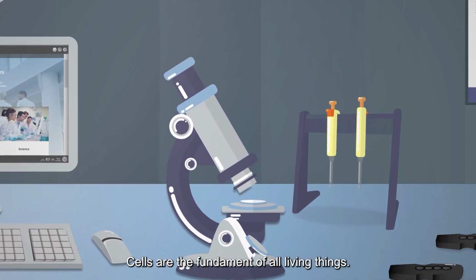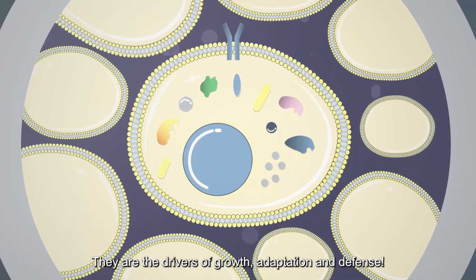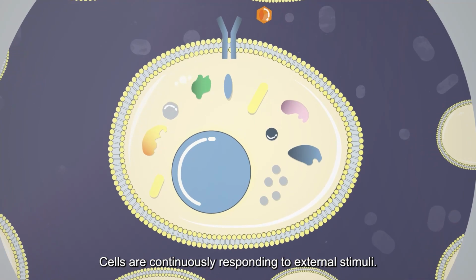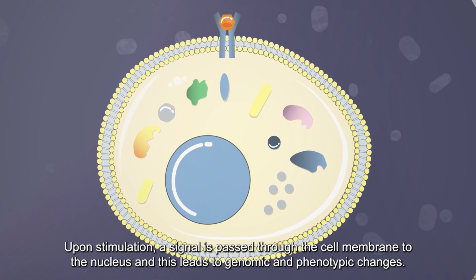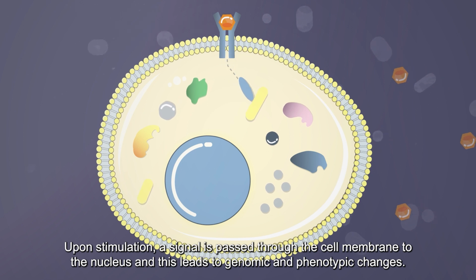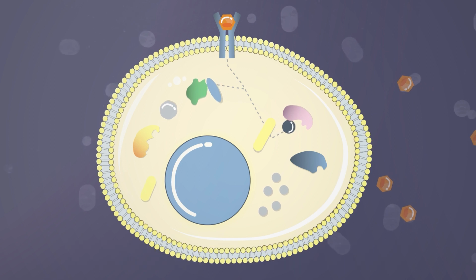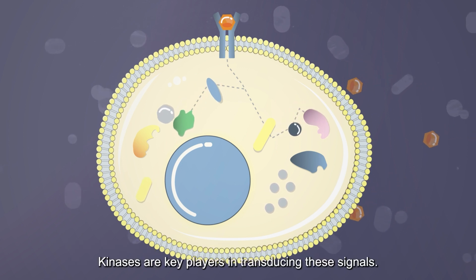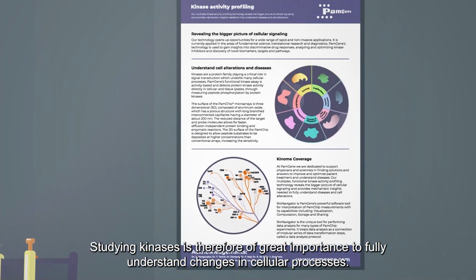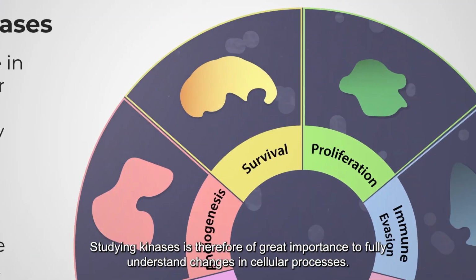Cells are the fundament of all living things. They are the drivers of growth, adaptation, and defense. Cells are continuously responding to external stimuli. Upon stimulation, a signal is passed through the cell membrane to the nucleus, and this leads to genomic and phenotypic changes. Kinases are key players in transducing these signals. Studying kinases is therefore of great importance to fully understand changes in cellular processes.